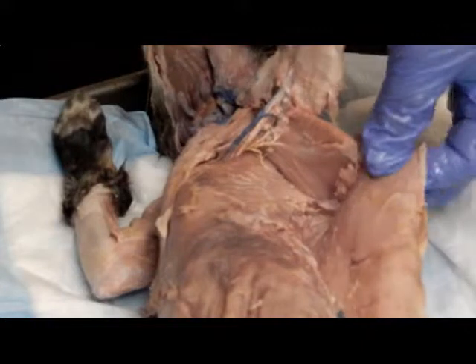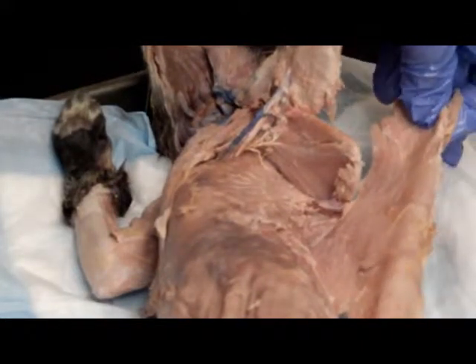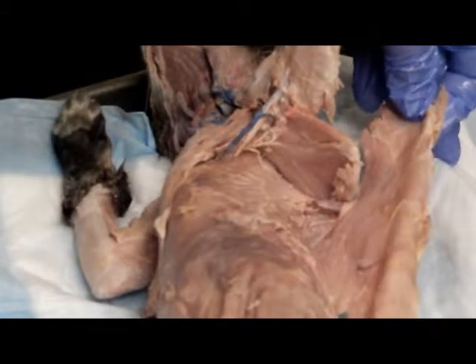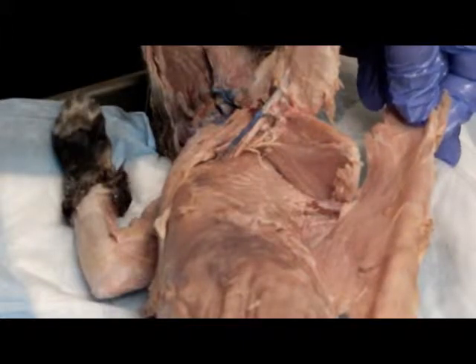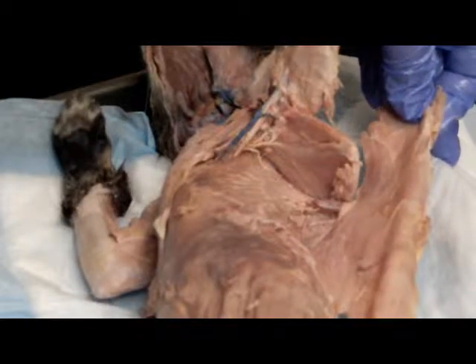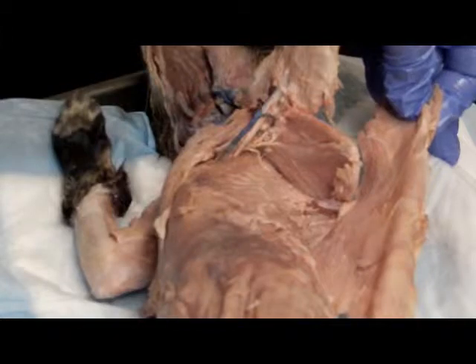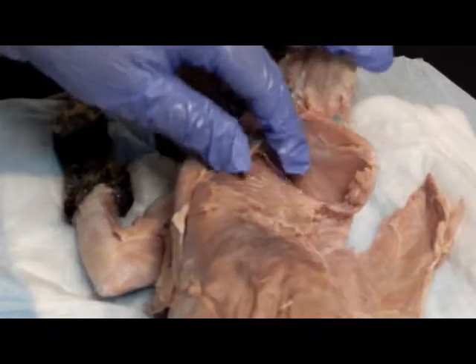This is the latissimus dorsi. Its attachment, or take that back, the origin is the neural spine of the last thoracic and most lumbars, and the lumbodorsal fascia. Its insertion is the tendon on the medial surface of the humerus. It's the prime mover of arm extension, powerful arm adductor, and medially rotates arm at the shoulder.